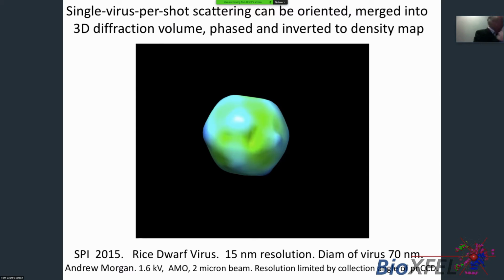Well, for the first time, we have the icosahedral symmetry here in this picture coming out of the data. Because of cleaning up the beamline under the single particle initiative, a crucial thing was Henry Chapman's idea of masking apertures to get rid of the background. Also much more accurate characterization of the detector, and the choice of a good sample, where all the particles are pretty much identical.